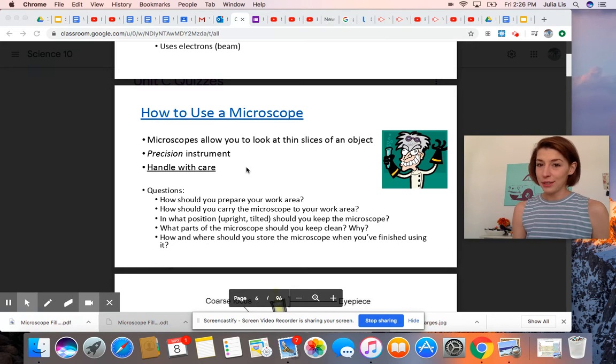So I do need you guys to watch this YouTube video, how to use a microscope. They go over a lot of the general rules when in a lab and using a microscope, how to set up a microscope, and then how to focus in on an image on a slide as well.